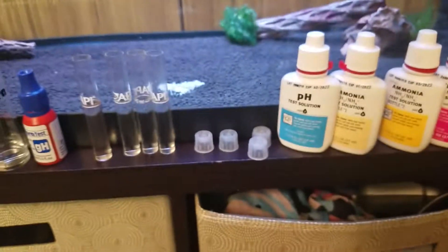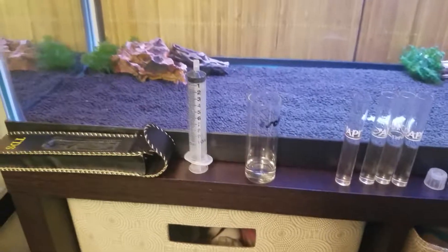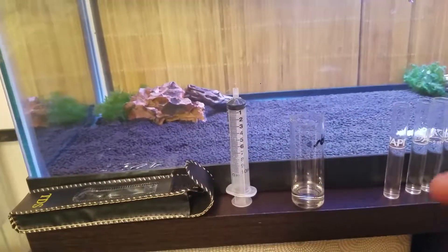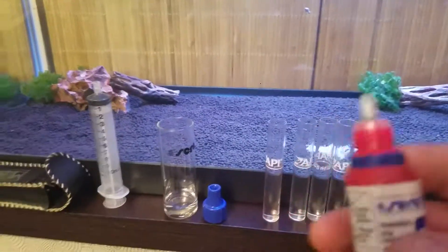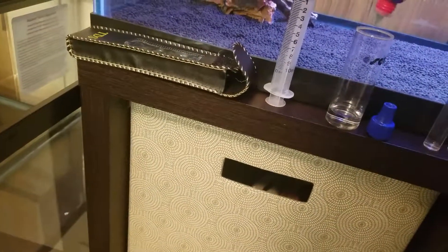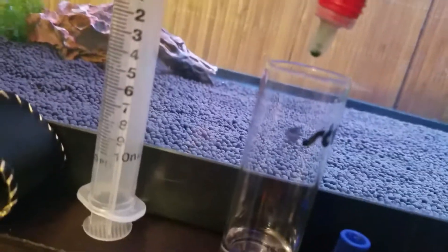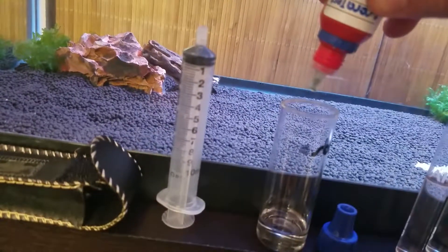We're going to follow this the way it says. Let's start off with the GH. The Sarah GH test kit is nice — they give you a large vial. You put five mils of water in and for every one drop of the Sarah kit, that is one GH. First you have to make sure when you start that you get all the air out before you give it the first drop, so that all drops are uniform in size.